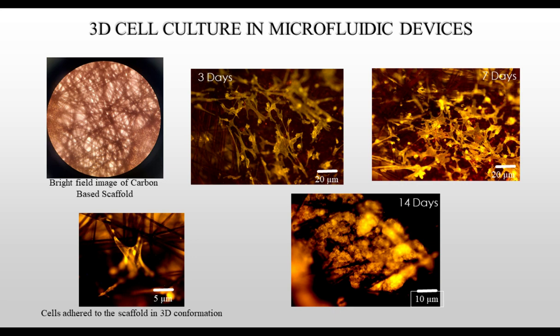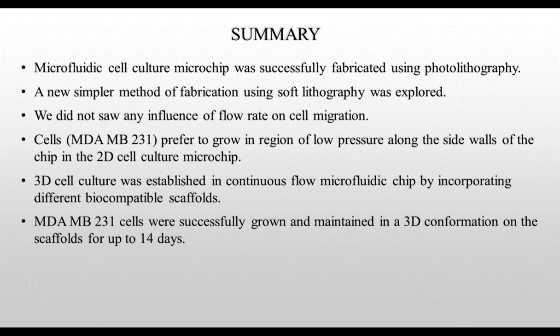As you can see in the image, we ended up with tumor mass of cells ranging from 100 to 200 microns in diameter. At present, we are working to characterize the scaffold and tumor bodies, and I have not included that data in the presentation.